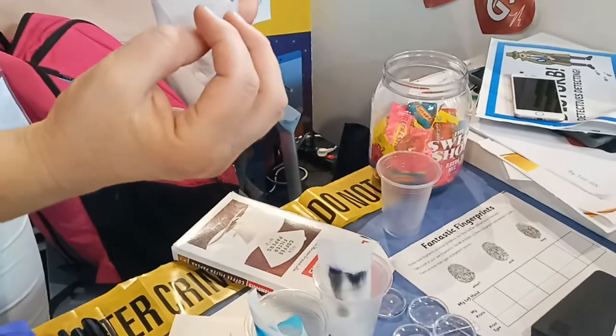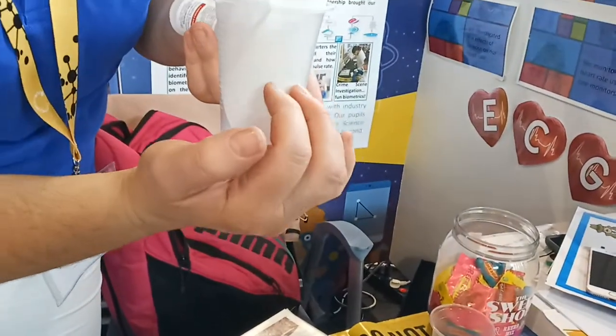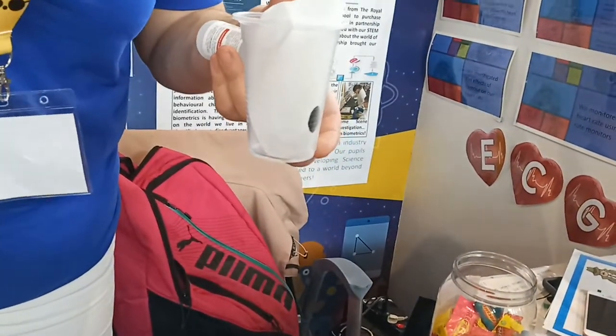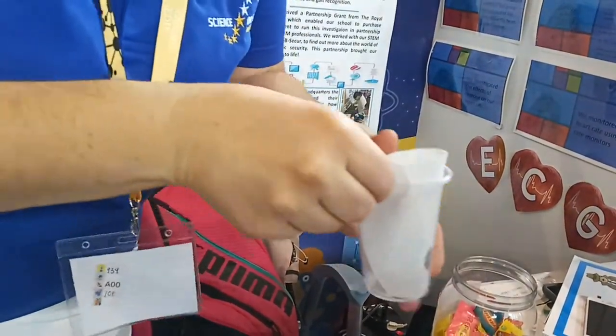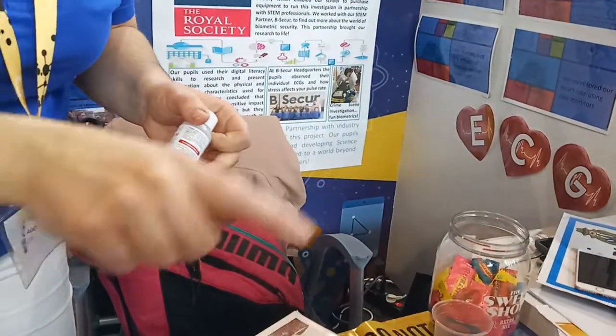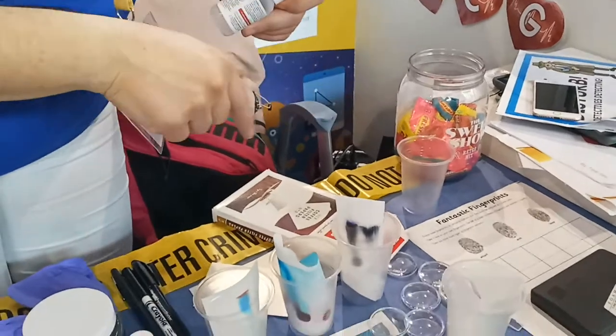The solvent travels, absorbs, absorbs in the filter. And it will separate the ink colors in the black ink. So you let it be for a while. You can come back and take this. You can keep an eye on it.